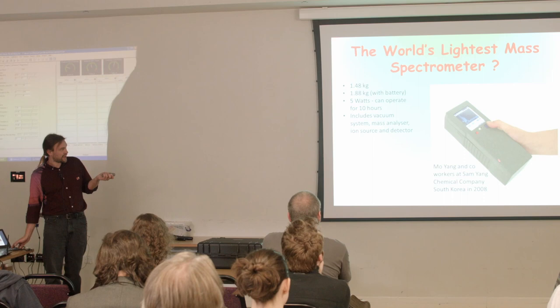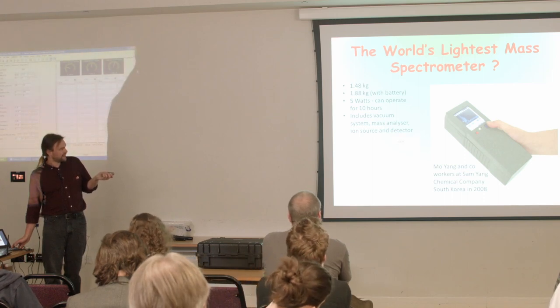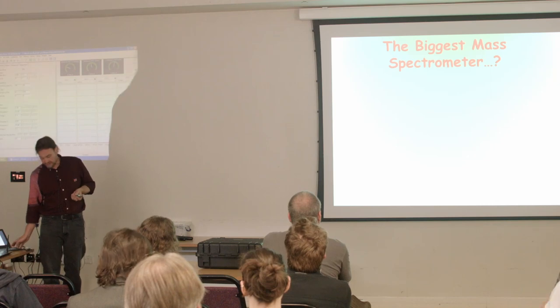This was done in 2008. I think this is still the world record. And this is detecting a precursor for sarin gas. So again, this is for use in what the Americans call homeland security.